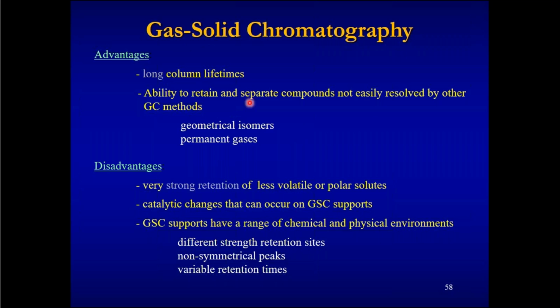Now, gas solid chromatography deals with separations based on adsorption and differences in adsorption coefficients, which are directly related to surface phenomena, how the solute gets attached. So any change in the spatial arrangement of the atoms in a molecule will show a difference in adsorption towards an adsorbent.